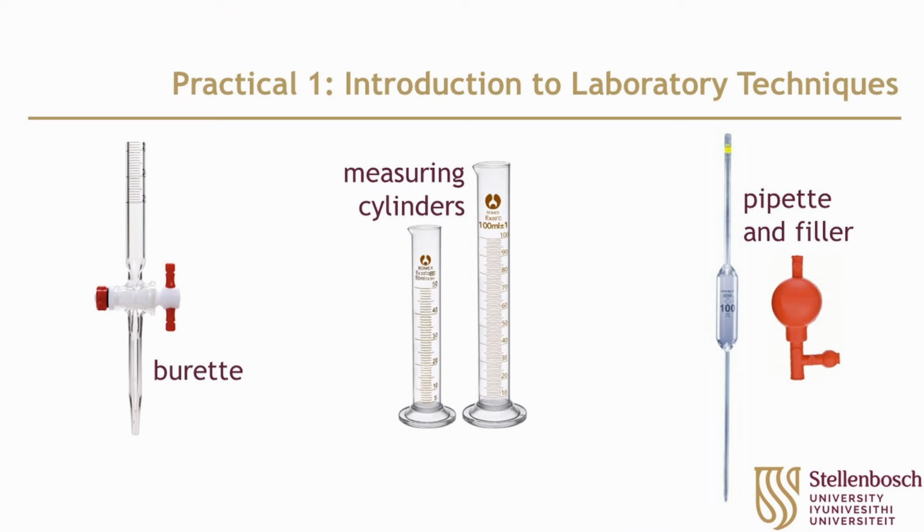Practical 1 is divided into two parts. In part 1, you will determine the concentration of an unknown sodium chloride solution by making use of density and a calibration curve. And in part 2, you will prepare your own sodium chloride solution of a specific concentration. Let's get started. Determining an unknown sodium chloride concentration.